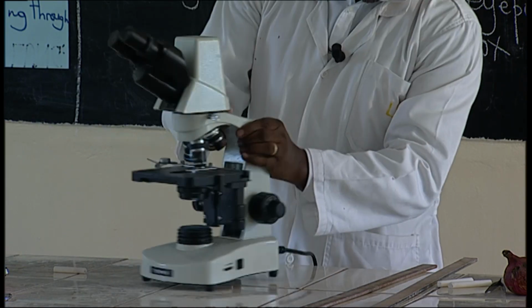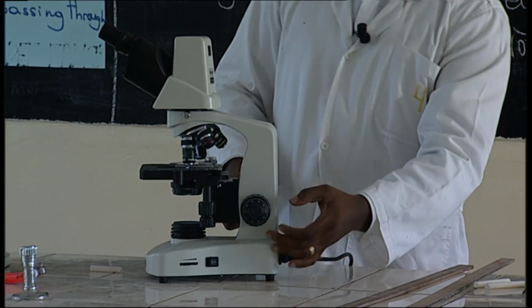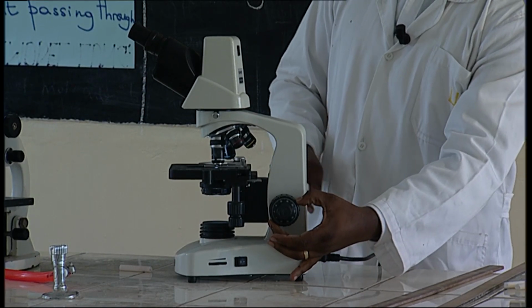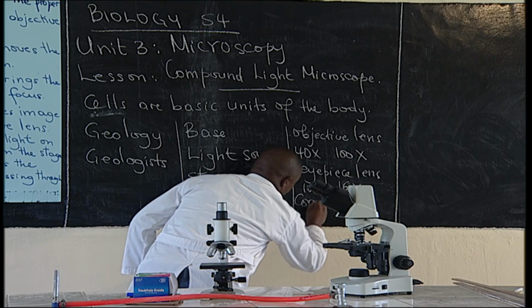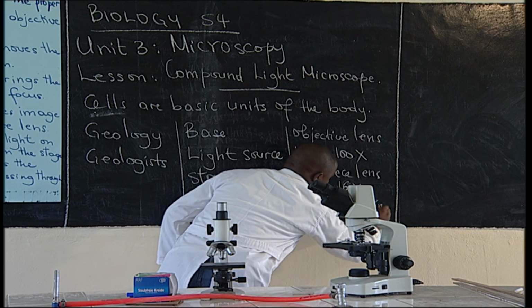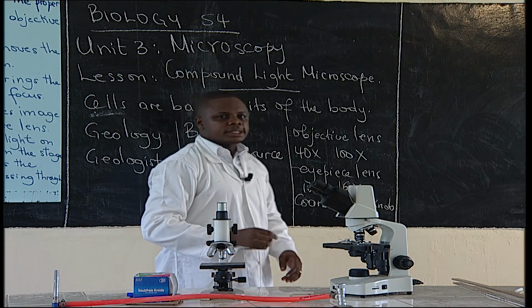Then on the side, we have what we call coarse focus knob.